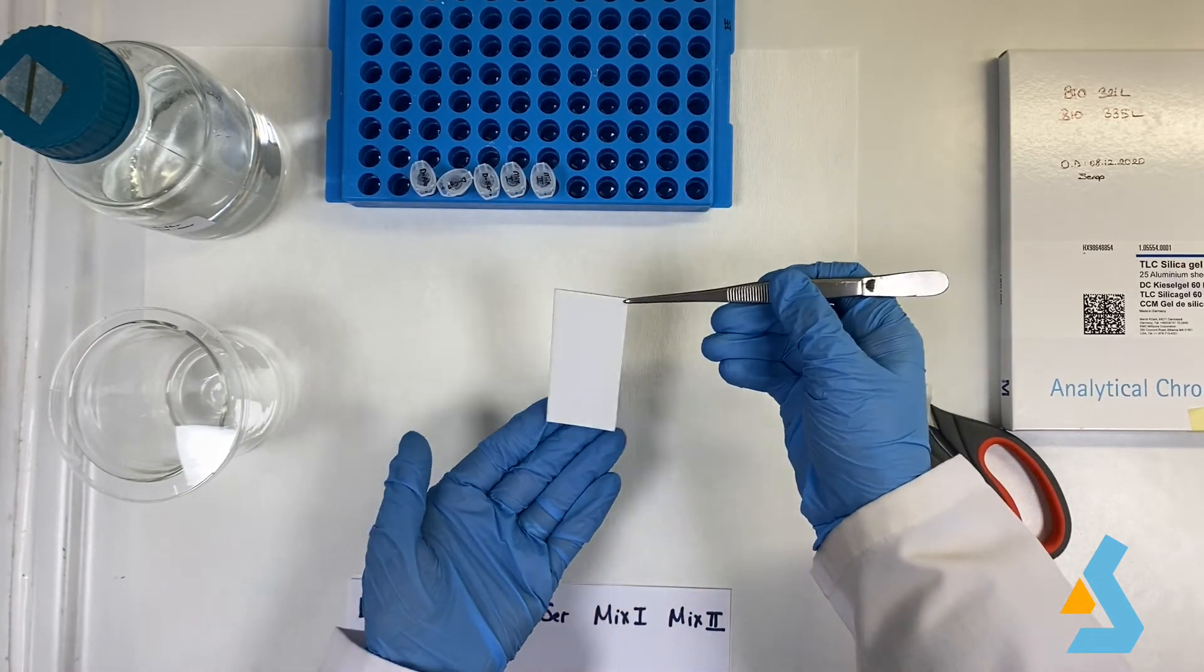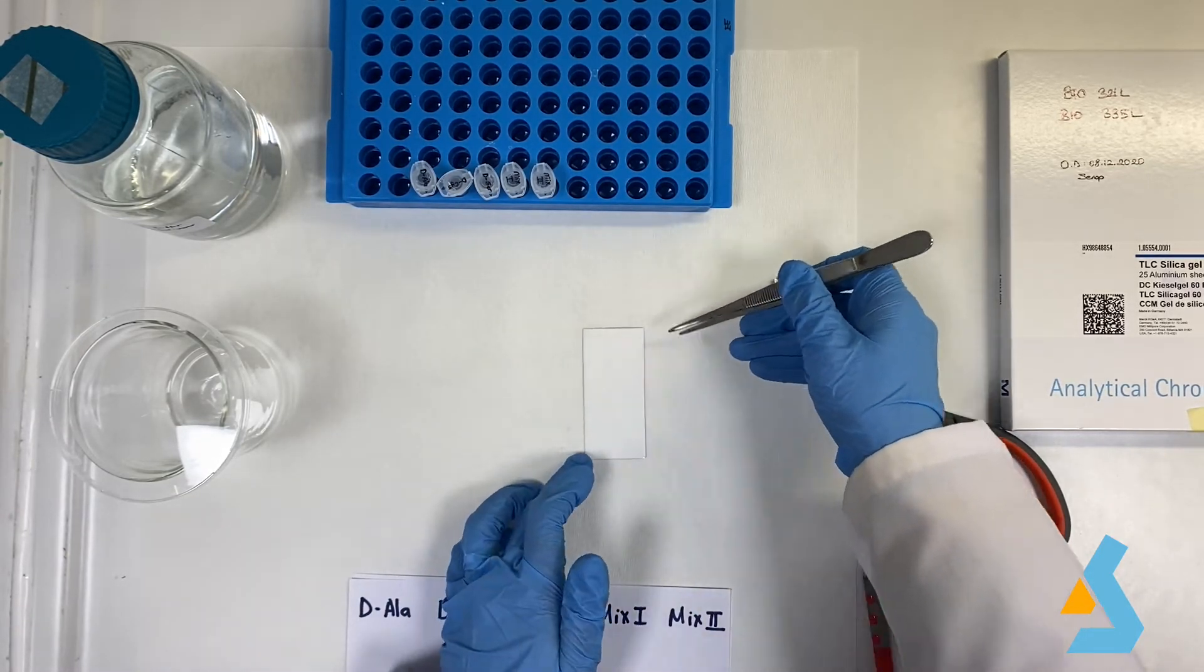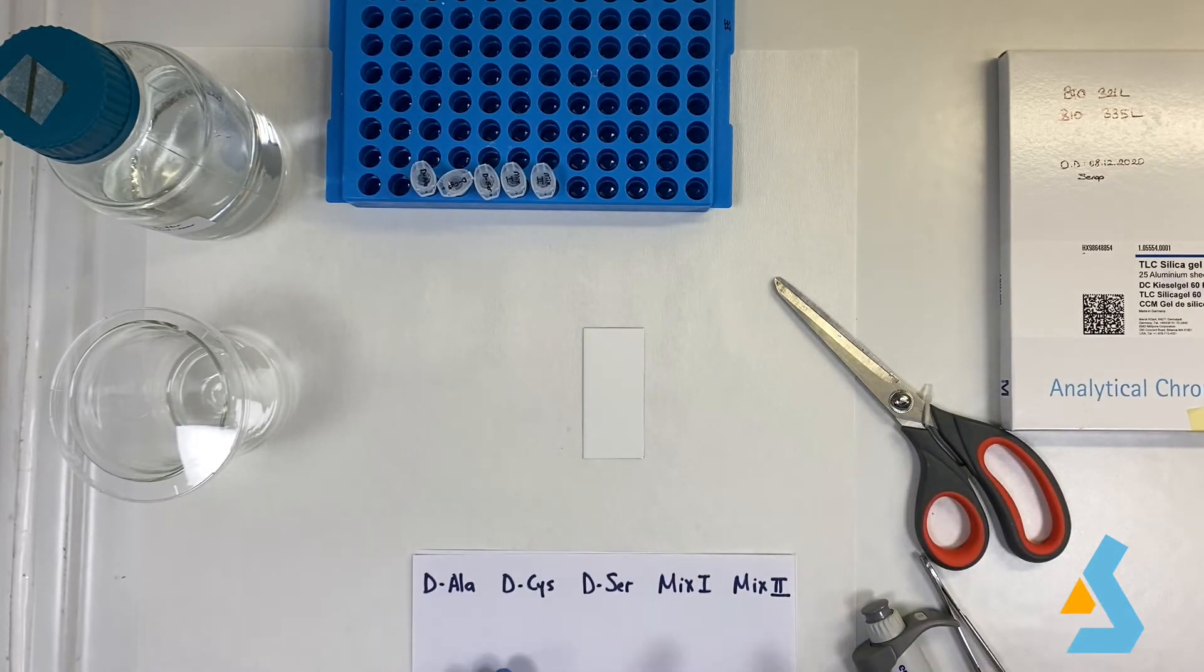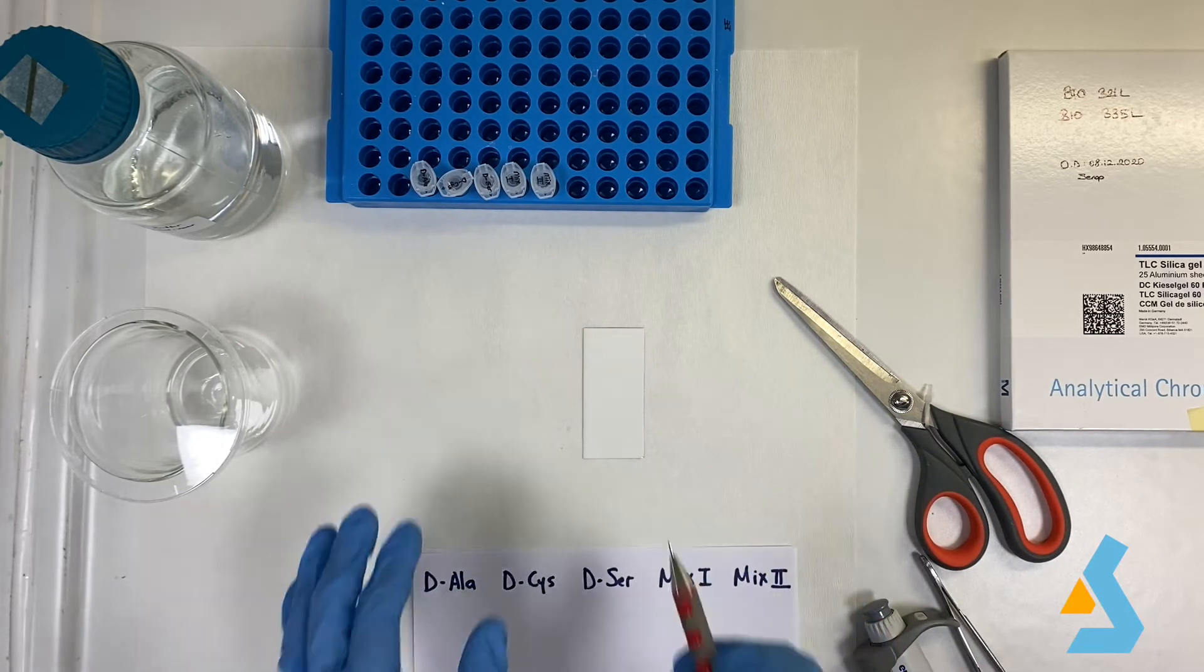In this experiment, we have five different samples as D-alanine, D-cysteine, D-serine, and two unknown mixtures.